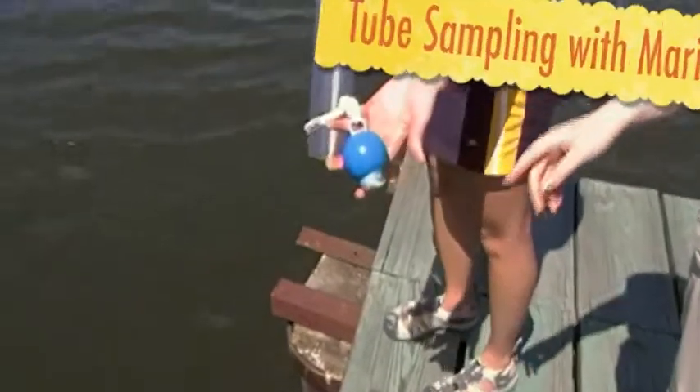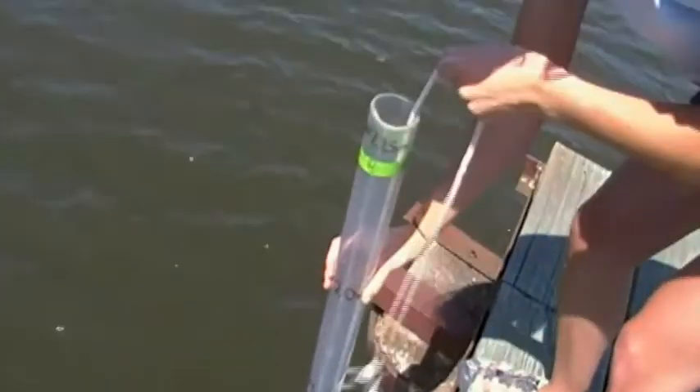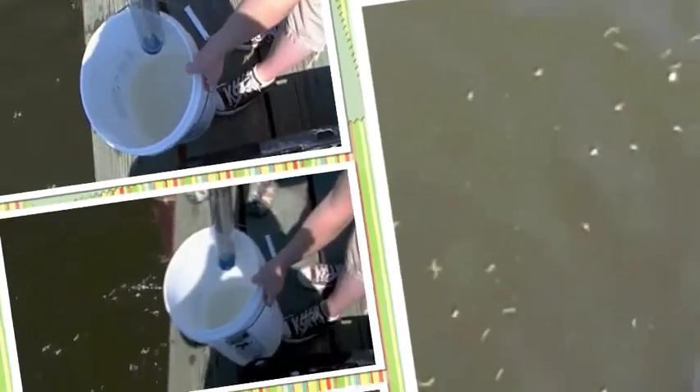A tube sampler consists of a PVC pipe with a rubber ball attached to a rope with a handle. To use it, simply drop it into the water to your desired depth at the side of the tube sampler. When at your desired depth, pull up the rope and therefore the ball. Then pull up the tube sampler, being sure to hold the rope tightly. Then release the rope, and you've got it in your bucket.